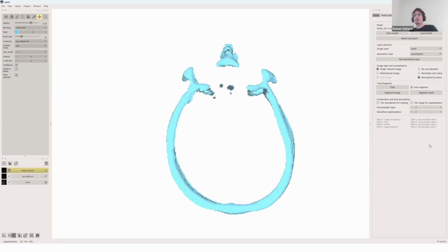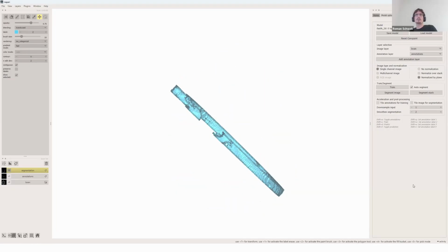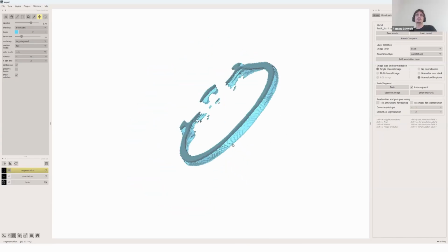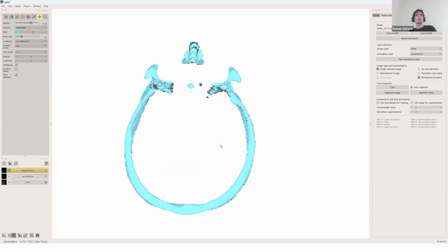Another little tip for Napari in general, a shortcut that I like to use a lot. This is not specific for Convpaint, so that's also why it's not listed here, but it's really good to know: Control R, which is just resetting the view. So especially in 3D, if you're turning it at different angles, if you press Control R, you're going to be back in the original view.